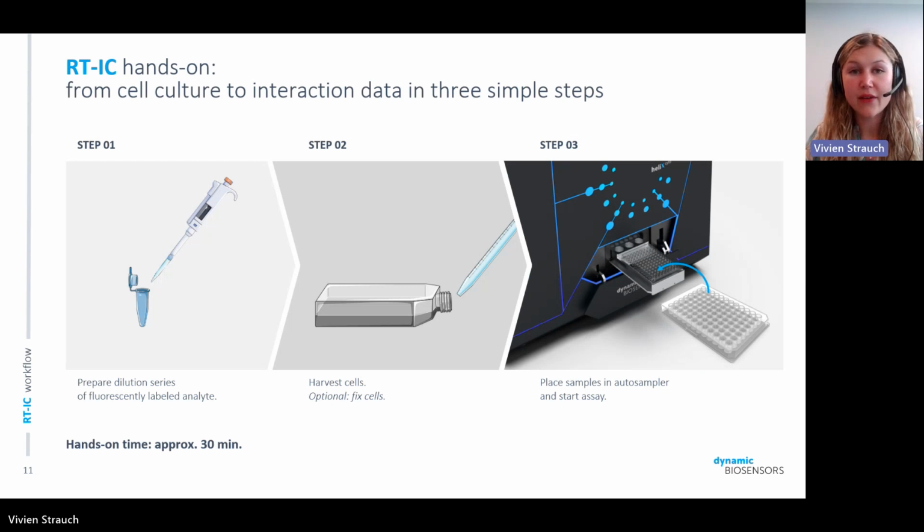So now about the automated steps in the workflow. I wanted to quickly show you what you have to do as a hands-on part in an RTIC measurement. And you can see here that there's only 3 steps which you have to do manually.